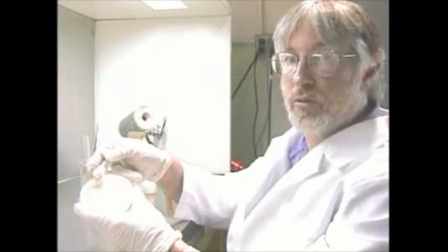What we do is we take a ginseng root. You can see in the photograph here, it's a thick, fleshy root, highly valued as a medicinal herb, as a matter of fact. We take that root and surface sterilize it, cut it apart, and take a small chunk of tissue out of the inner portion of that root and place it on the appropriate nutrient media containing a combination of plant hormones, auxins, and cytokinins. And these induce the cells from the root to begin to divide in an unorganized fashion and give rise to a callus, similar to the callus that we talked about in the case of graft union formation.